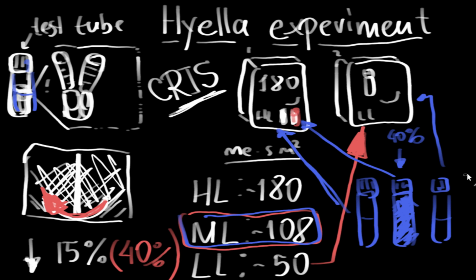And we're gonna see how pigments gonna change in these 3 treatments, and we expect them to be very dark. The high light dark colonies gonna be here, and the same gonna be here, dark, because it's gonna be carotenoids, and in the middle we're gonna probably see a lot of chlorophylls, and that's why it's gonna be green color in the middle light.